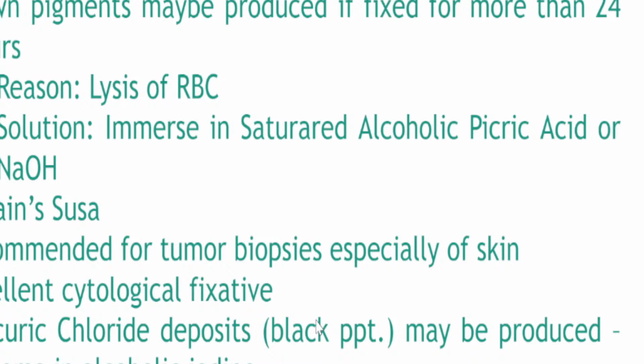Pero sir, kasama na yung Zenker fluid. Zenker formol or Helly's fluid. Dagdagan mo ng pituitary pag ano. Madali nang maalala, class. You just have to make associations wherever it's relevant. Kahit walang kakwenta-kwenta katulad ko. Okay? Walang kakwenta-kwenta yung mga binibigay ko.